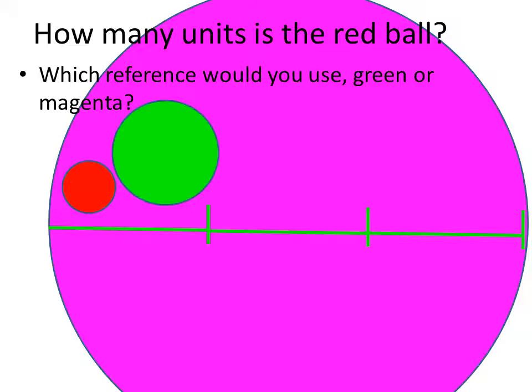So what this actually represents is the field of vision at a higher magnification, and this is the field of vision at a lower magnification. And no, I did not get that backwards, so if that doesn't make sense to you, stop and think about that. This is the field at a higher magnification. Objects look bigger because we're looking at a smaller field. This is what's represented by the lower magnification. You can fit more objects into it because you're not looking as closely.